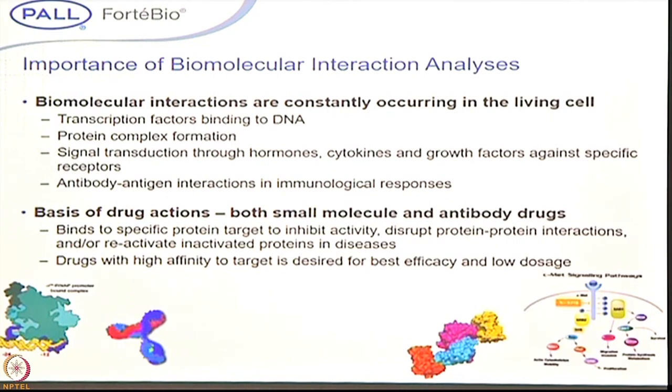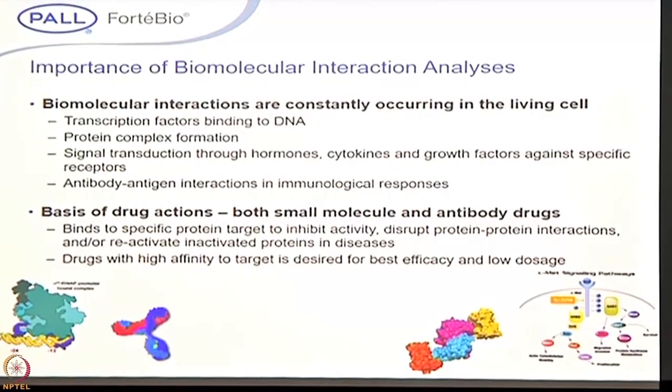Even when it comes to drug discovery, we want to understand the mechanism of interactions, how the drug is binding to the particular target. When we are discovering such molecules, we have to look at the affinity. I can give a simple example about the dose. Some drugs you have to take three times a day, some drugs once in a week, some drugs once a day. So how is the dose decided? These doses depend upon the interaction platforms.